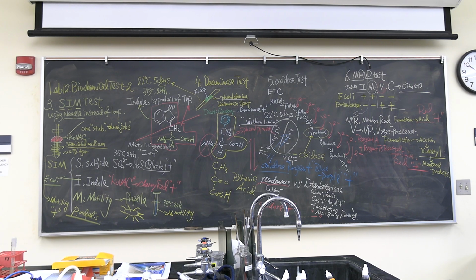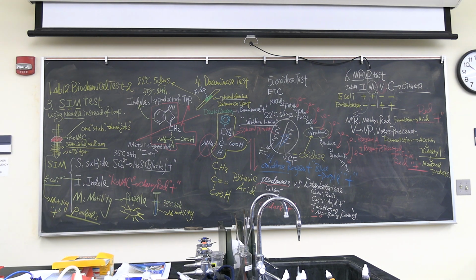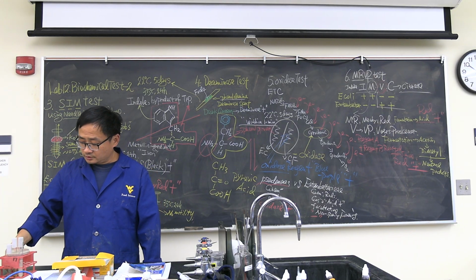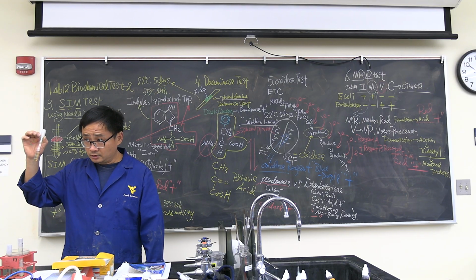Okay? So today we're going to do SIM, deaminase, phenylalanine deaminase, oxidase, and MRVP test. How do we do it? Everybody come here to get a plate. Wait a second, no. Phenylalanine, SIM test. What do I have so far? Okay, we have these. So come to your desk. Okay, listen. SIM test. Remember, use a needle.